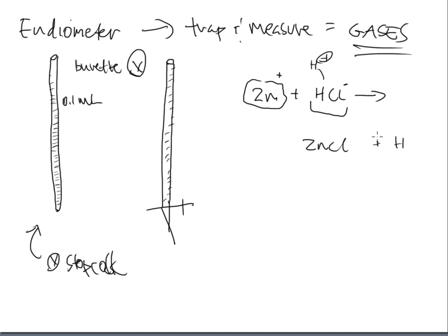And I promise you, I do not have relationship problems. So zinc and HCl come together, and zinc will replace the hydrogen. So what we will often say is that a single replacement reaction has happened here. And that single replacement reaction means one thing, single, has been, guess what? Replaced. So the hydrogen is getting replaced by the zinc, and zinc and chloride now make a compound, and hydrogen is like, okay, I didn't like you anyway. See ya. I mean, that's what hydrogen does.